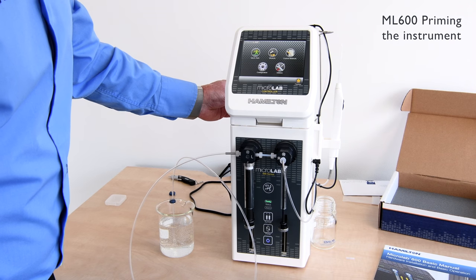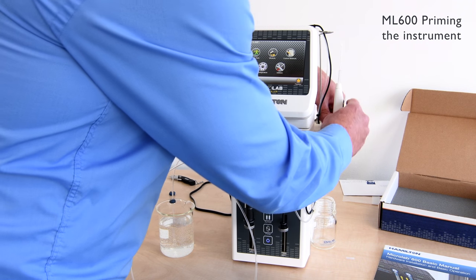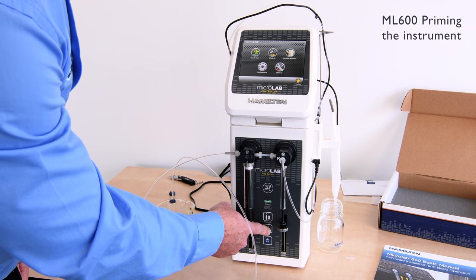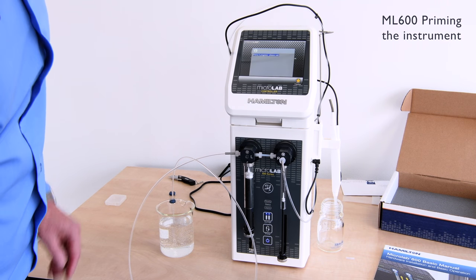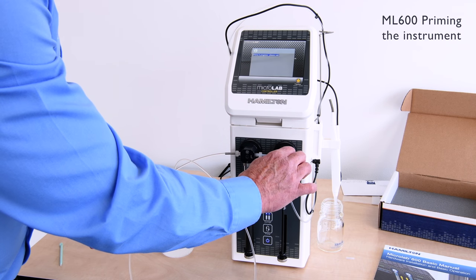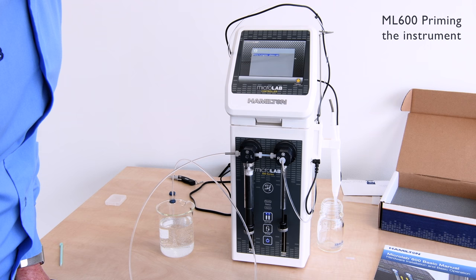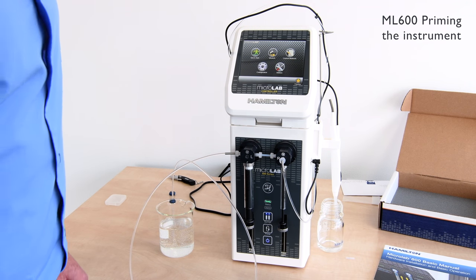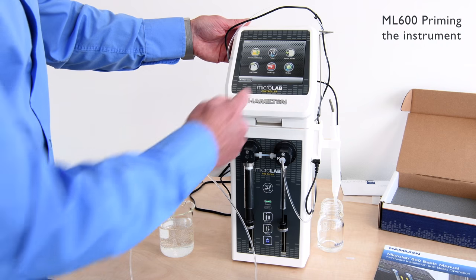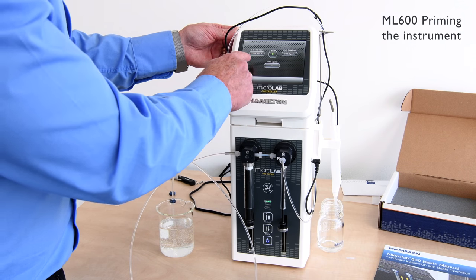So we're going to conduct the priming sequence. Firstly, you need to get the probe positioned to waste. Using the prime button, drawing fluid into the syringes. At this stage we can check that all points are gas tight. The prime sequence can also be carried out using the function in utilities, which shows the prime sequence and allows us to select the number of cycles we want to prime for, and the speeds we're driving at.